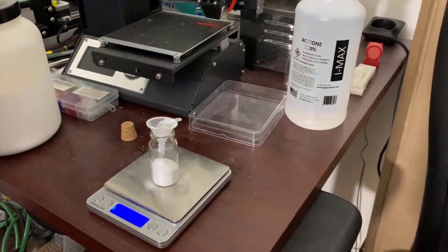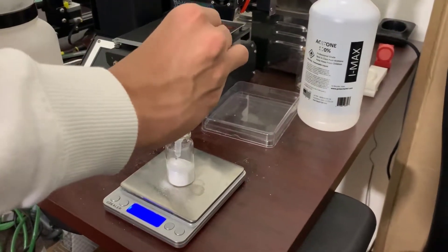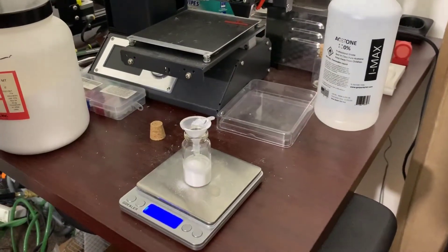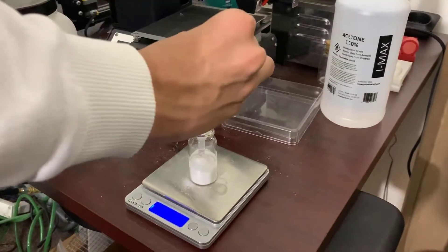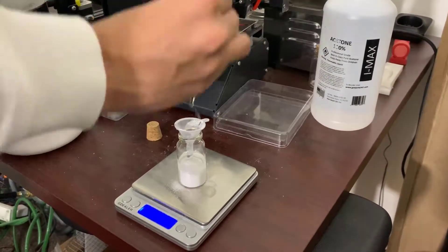After you have about 4 grams of cellulose acetate you can start putting the acetone in. I am using a pipette — a bottle with a pipette. I found that's just an easier way to put the acetone into the bottle, as pouring is a little difficult with the funnel.